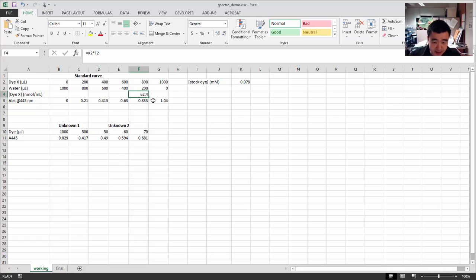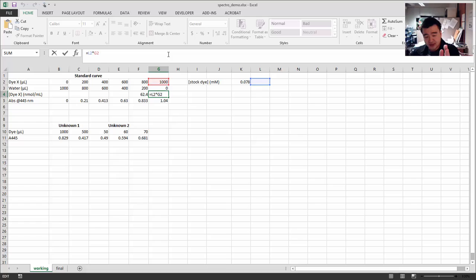Now, Excel is really great because you can get it to propagate this formula for you, so you don't need to write it again and again in each different cell you want the formula to apply to. In order to do this, there's a thing called click and drag. Hover your cursor over the bottom right hand side of the cell, then click on it and literally drag this formula across. What Excel does in this instance is push the formula and update the cell references to the left and to the right. And sometimes that's quite useful.